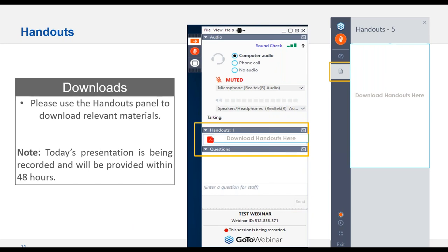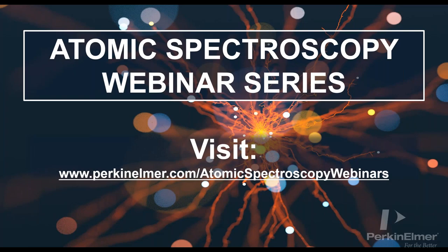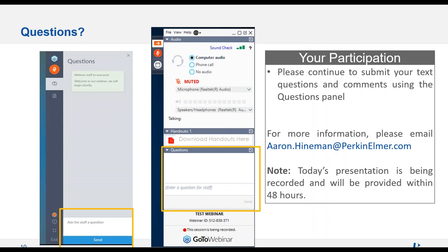And the reason I'm saying that is because with rock digestions, we do something called a lithium metaborate flux fusion, where we're literally mixing the rocks with lithium metaborate, cooking it at high temperature, and turning it into a magma, and then dumping it into a bucket of acid to digest it. So if you're doing lithium work, really high percentages of lithium are going to get all over the place. Yes, it will contaminate your sample. So you really want to keep the room as clean for lithium as possible. But a full-on class 100 clean room, no, you don't need that.